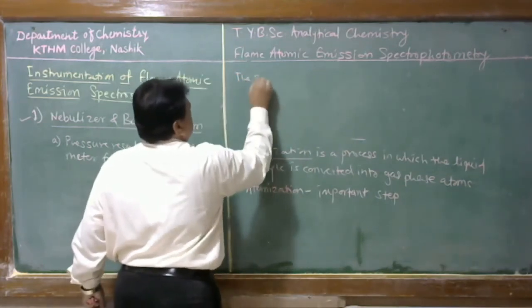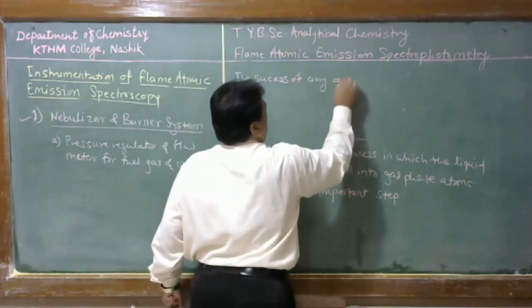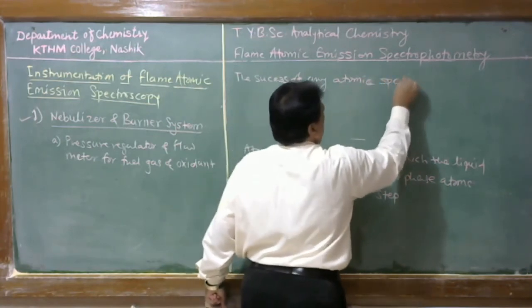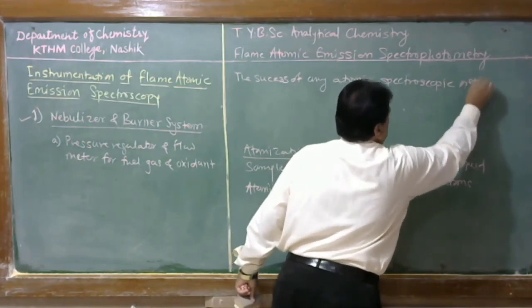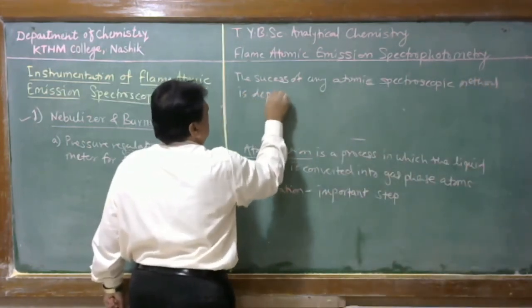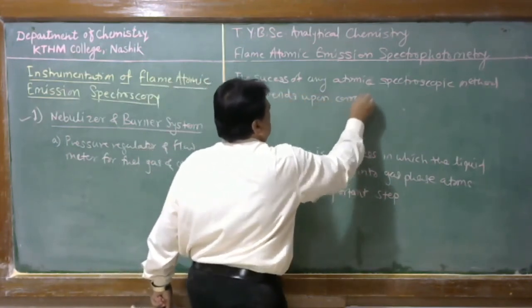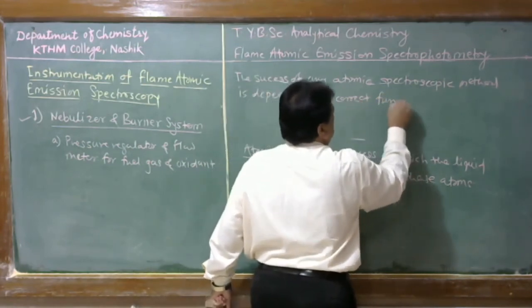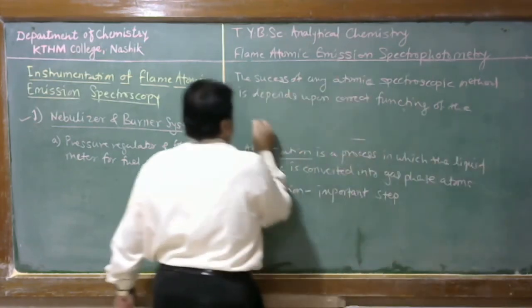The success of any atomic spectroscopic method depends upon the correct functioning of the atomizer.